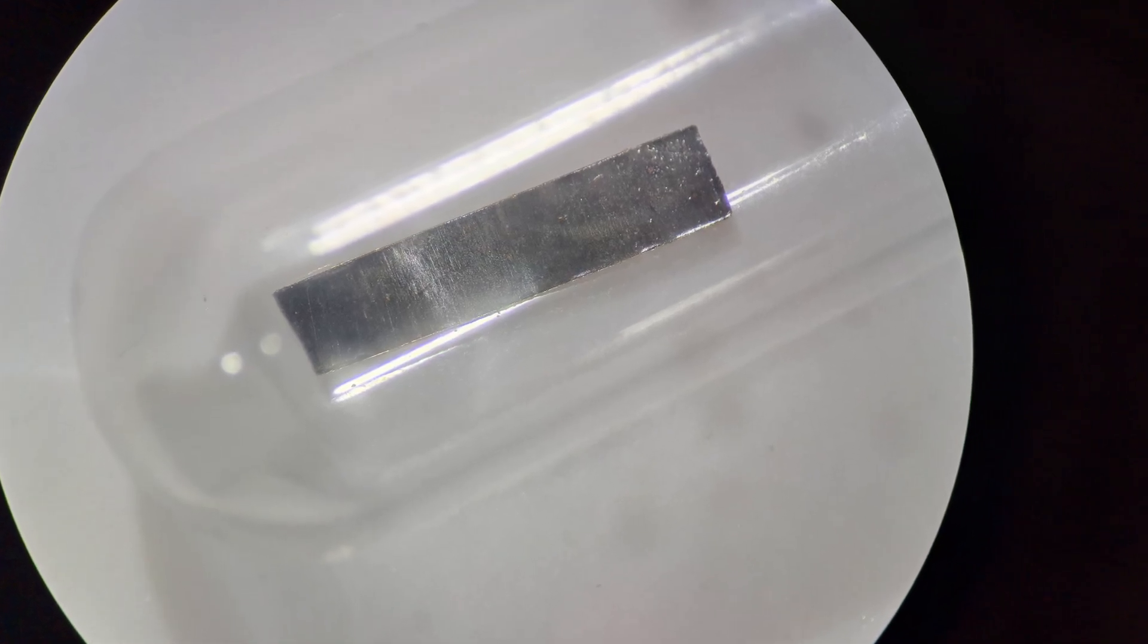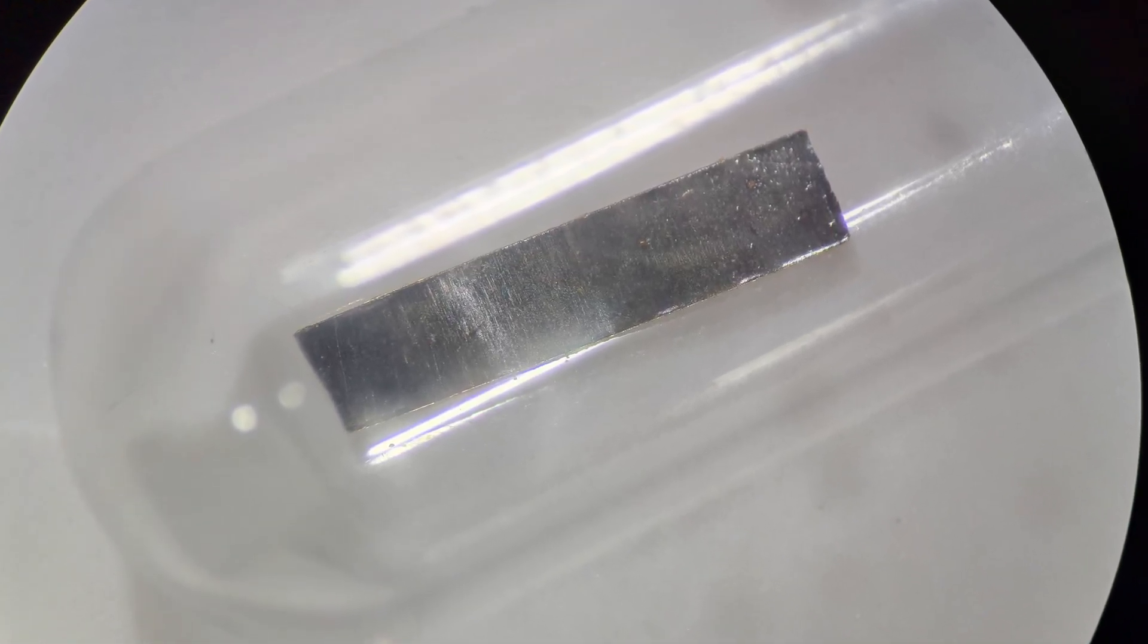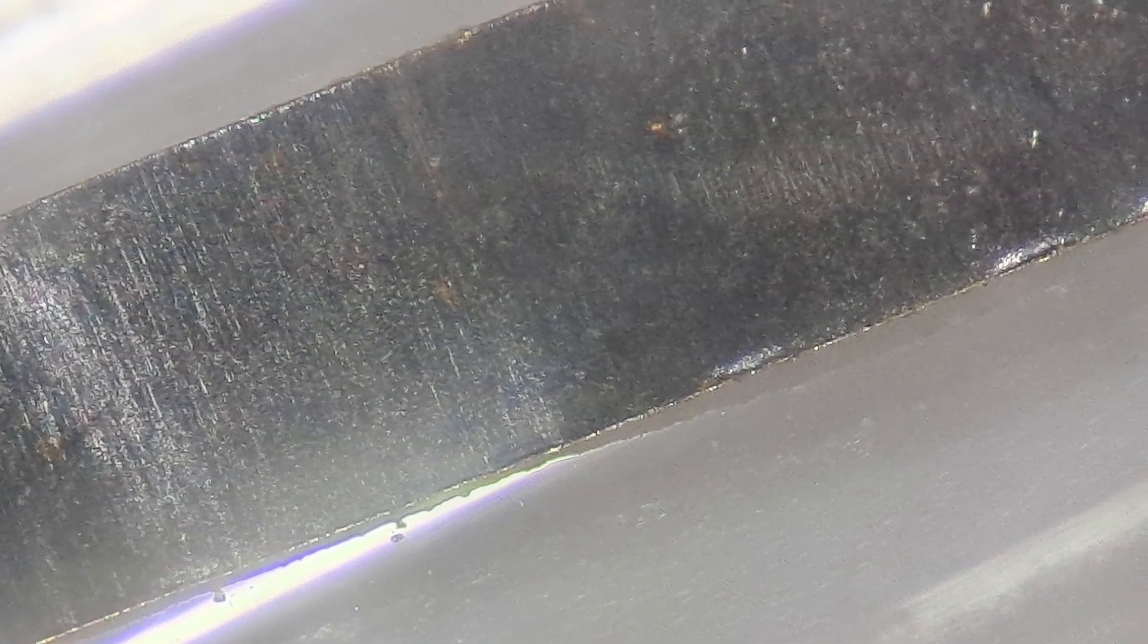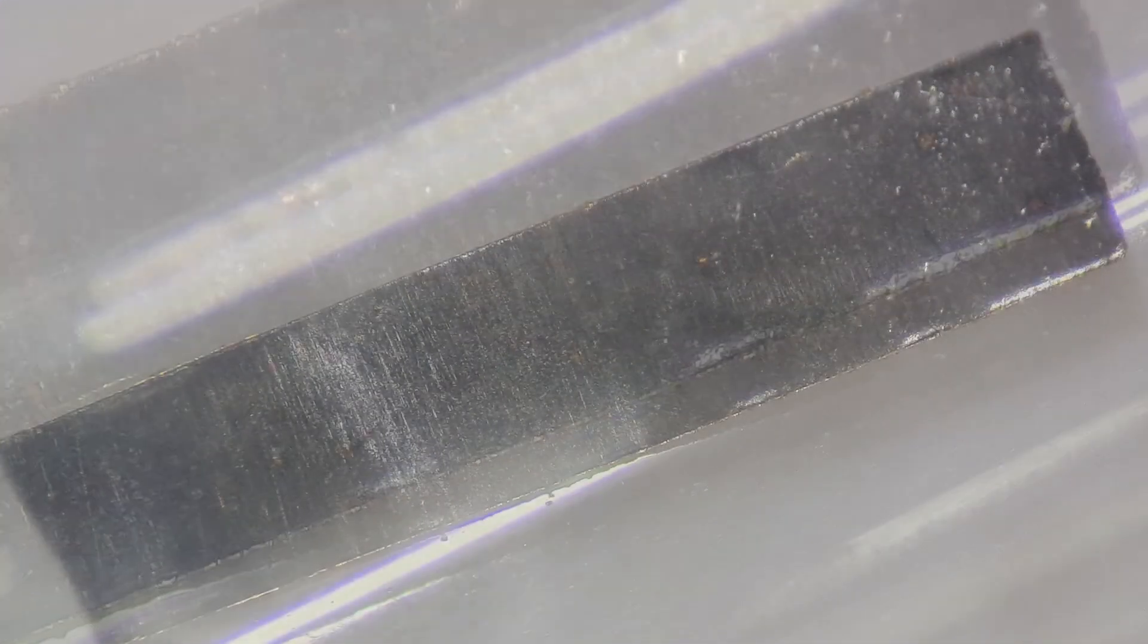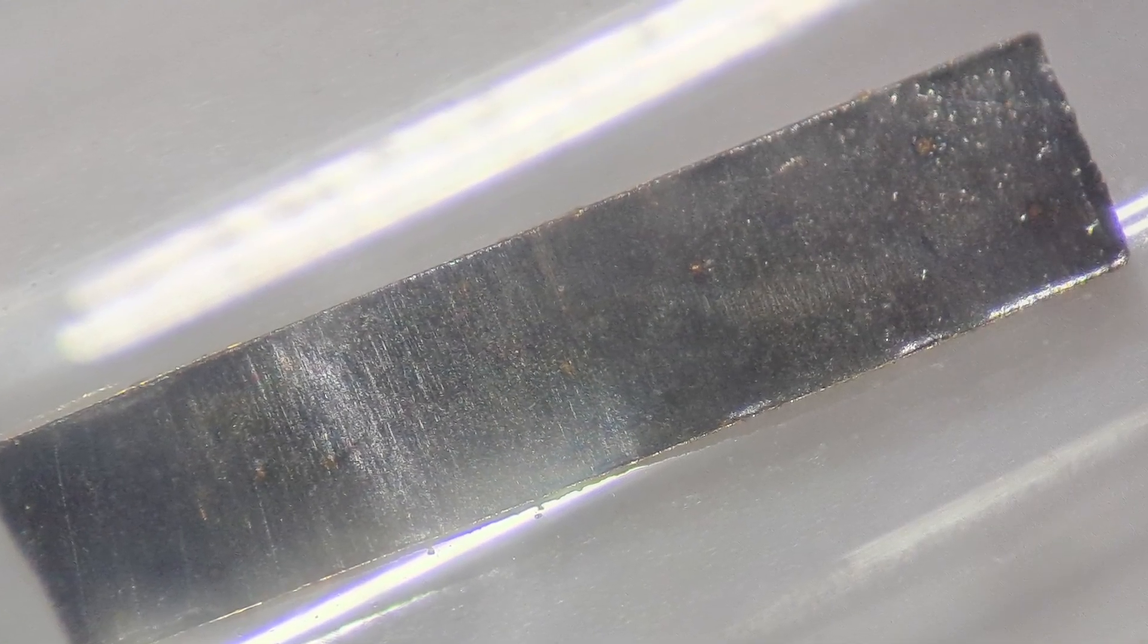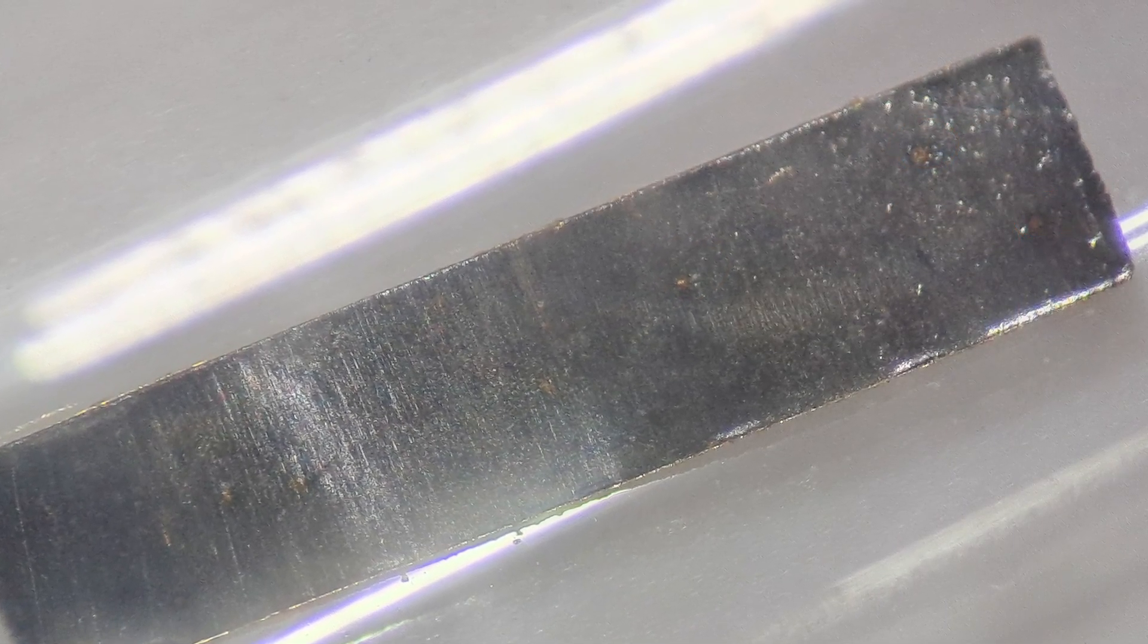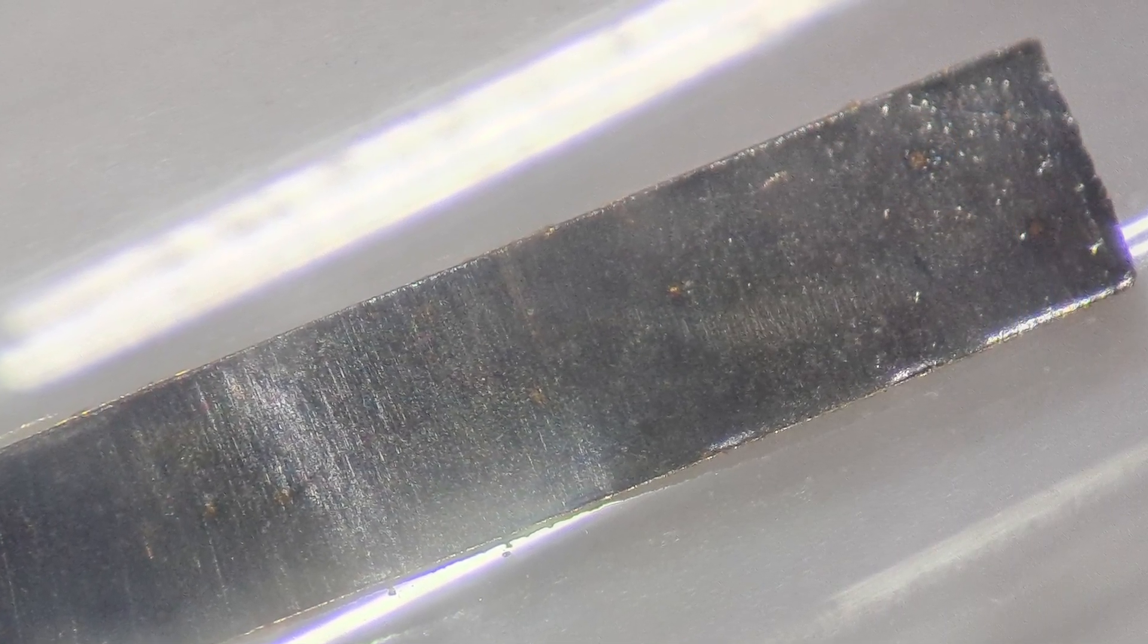When I put this piece under the microscope, you can see that it is indeed gold. On the edges, you can see cut marks where the gold shows through. And if you look on the surface, you can see spots here and there where the gold is directly visible. So the layer of this still unknown metal is not really thick.